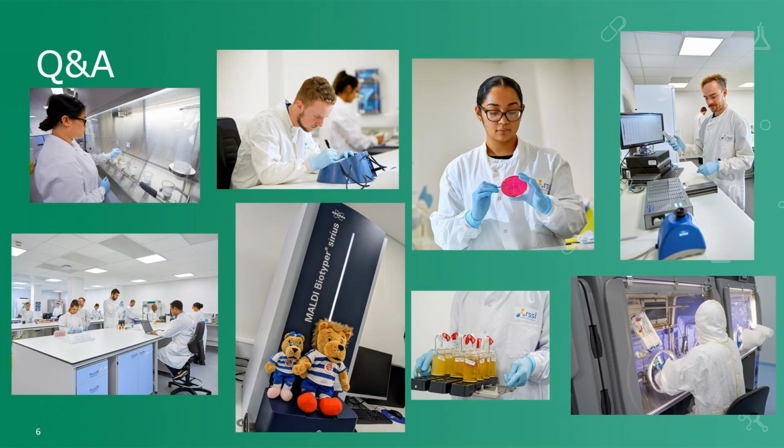So it's seen as a greater challenge to use spiny spores because more of the surface is covered and the fungal spore is harder to remove from the surface. So you're kind of doing the worst case challenge. Whereas if you use smooth spores, they wouldn't necessarily be as difficult to kill.